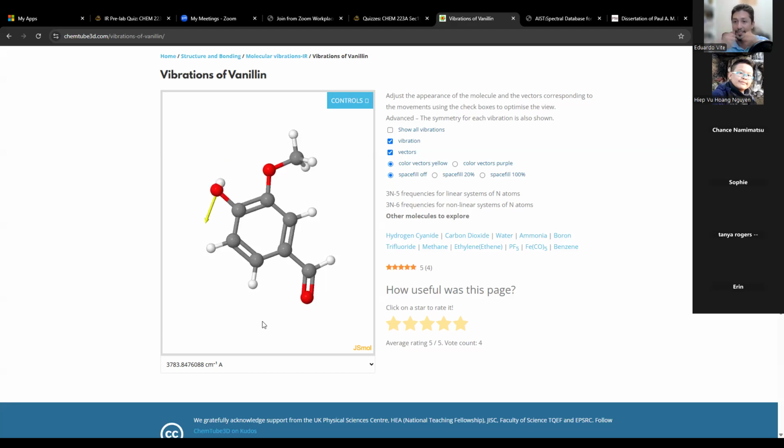They're very close together in mass, remember? It's a spring with 2 masses. And so oxygen weighs 16 and hydrogen only weighs 1. So it is a very polar, heavily size different bond. And you see the size of the arrow, that's huge, right? So it takes a lot of energy to vibrate it, but when it vibrates, it's very intense. Does that make sense? And only this molecule can vibrate at only this frequency because that's how much energy it takes to vibrate an OH bond.